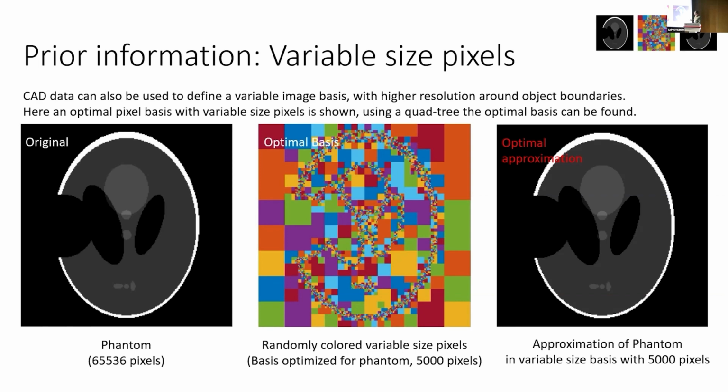So we can talk about a representation of our image within these voxels, and the image on the right is the same as the image on the left, but using these voxels. You don't see any difference between that one and that one, just because this set of voxels, there are 5,000 different voxels in here, all of different sizes, and they allow me to get exactly the same resolution as I have in this original image, which is 256 by 256, so 65,000 pixels.